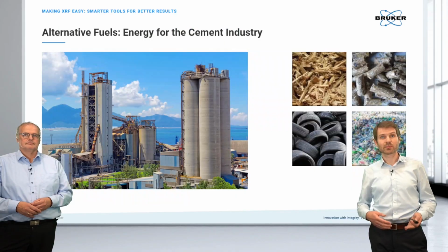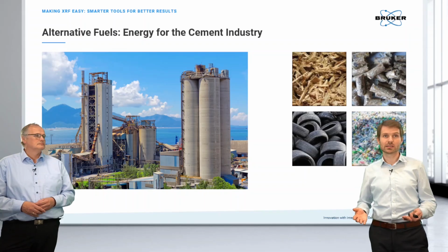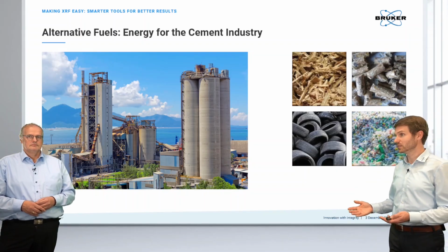Another example that I want to bring to you is alternative fuels. Alternative fuels are used frequently in the cement industry.